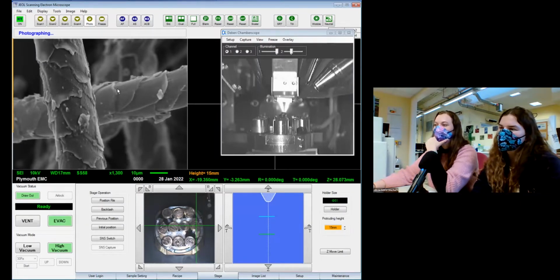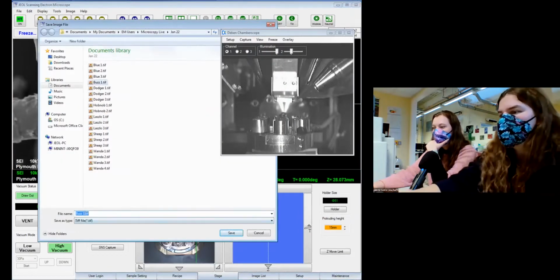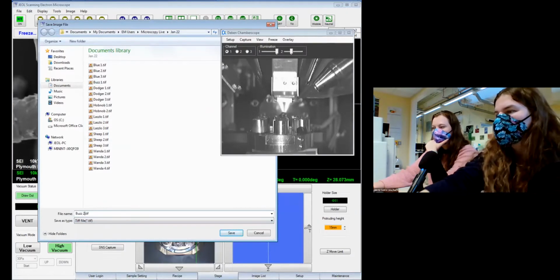Yeah, the same sort of overlapping pattern. It's very different to cat hair, very different to horse hair. But very similar to the other dogs. So not much variation within dogs by the looks of it, as well. Outside of the dogs. There we go.